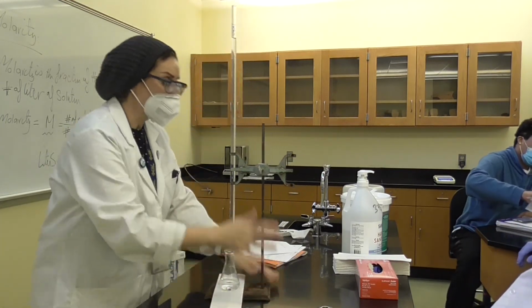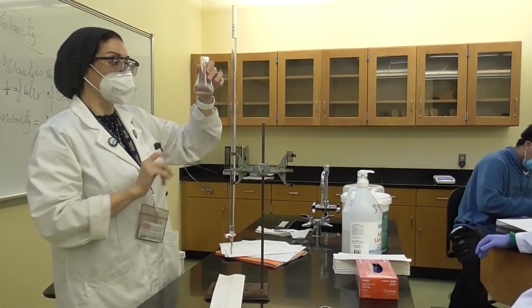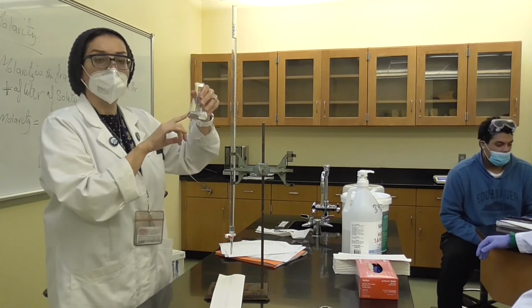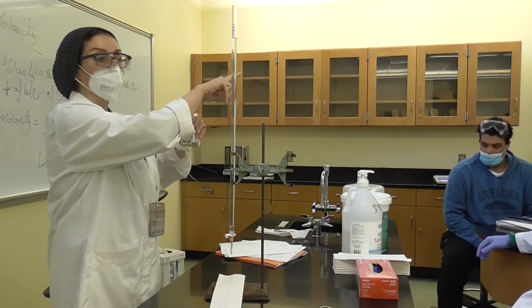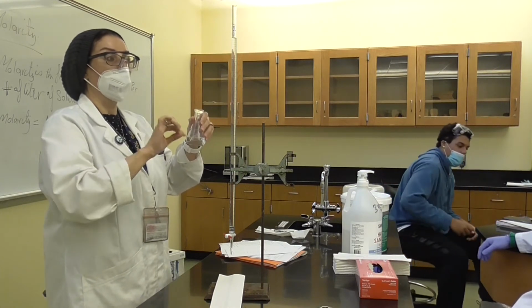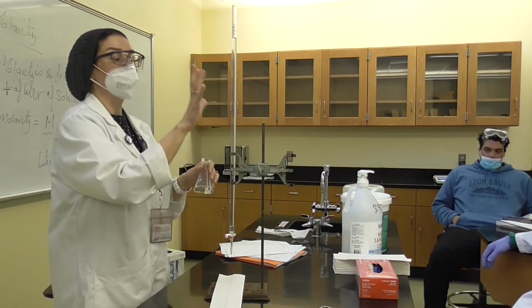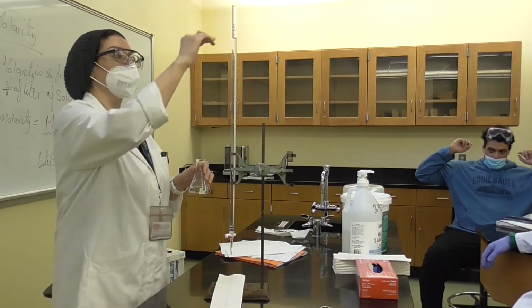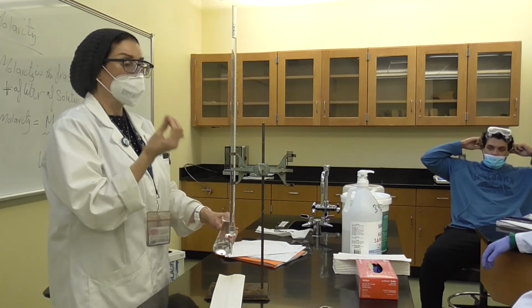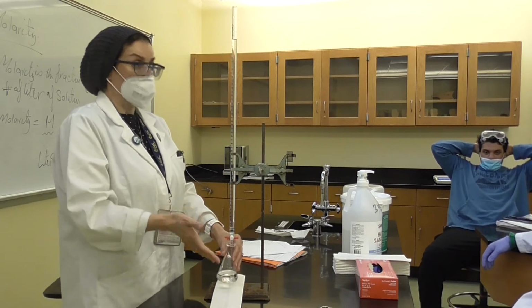All right. So this is done, right? This is one of your peers who is done with that. They prepared 3 of them, and this is one of them. It has the 5 ml of the unknown vinegar, it has 50 ml of water, and it has 3 drops of the indicator, which is phenolphthalein. This one has been calibrated, filled up to this, and now we're going to start the titration. The technique is very simple, but you need to learn it.